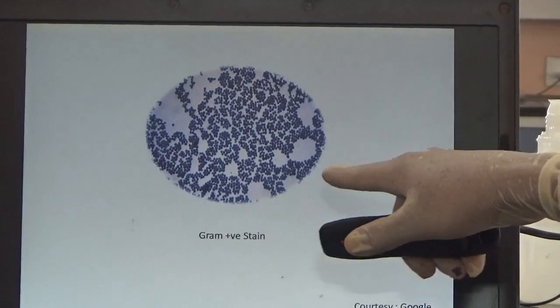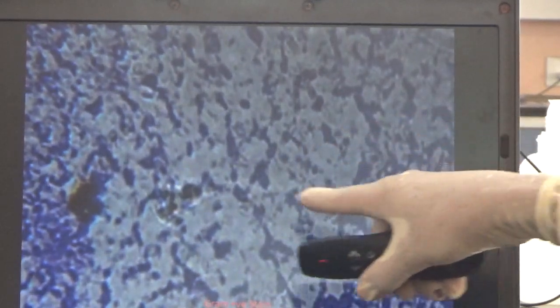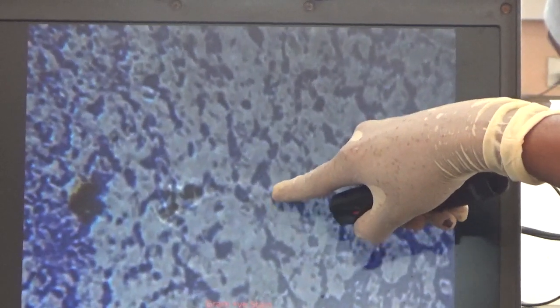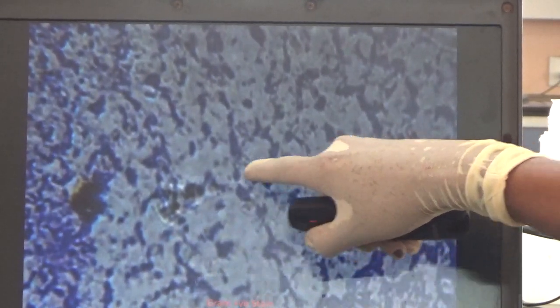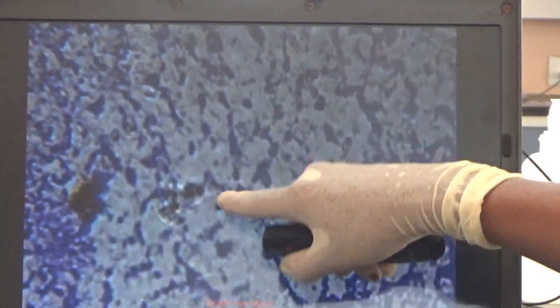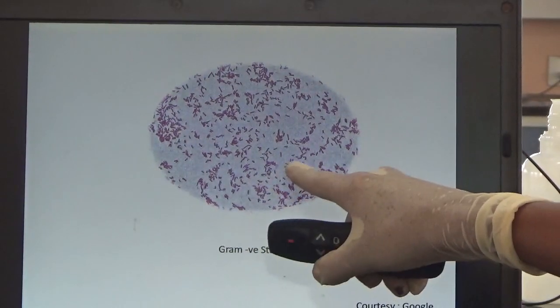You can see here: Gram positive stain showing bacilli. This is a Gram negative stain showing bacilli. This is a Gram positive stain. This is a Gram negative stain showing bacilli.